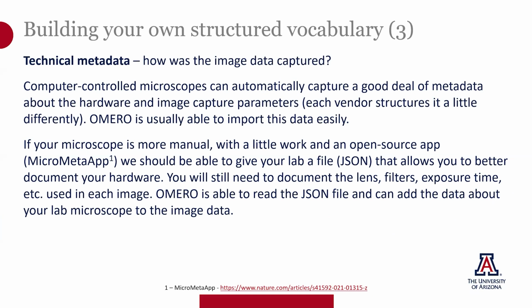Then OMERO reads that file, and the person adding the data can tell OMERO information about all their specific acquisition parameters. And again, who captured the images? Was it the person who uploaded them to OMERO or someone else?